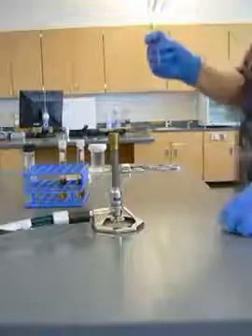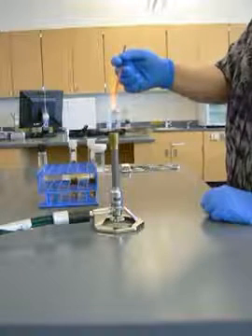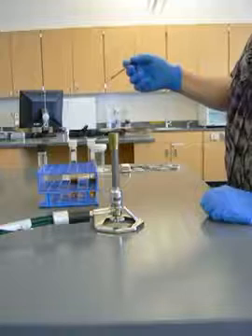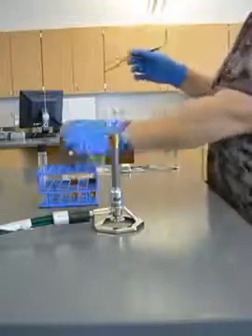I'm going to take my inoculating loop and I'm going to sterilize it. I'm going to wait for a little bit so I don't sizzle my poor little microbes. If I put my loop in and I hear it sizzle, I know I've killed them all. So I can agitate a little bit to pick up live microbes.